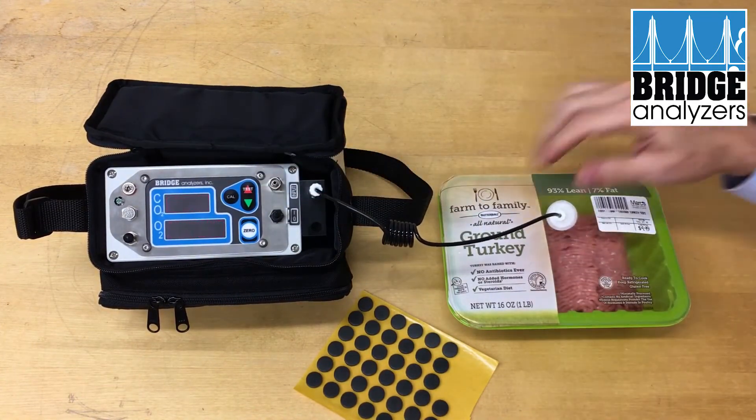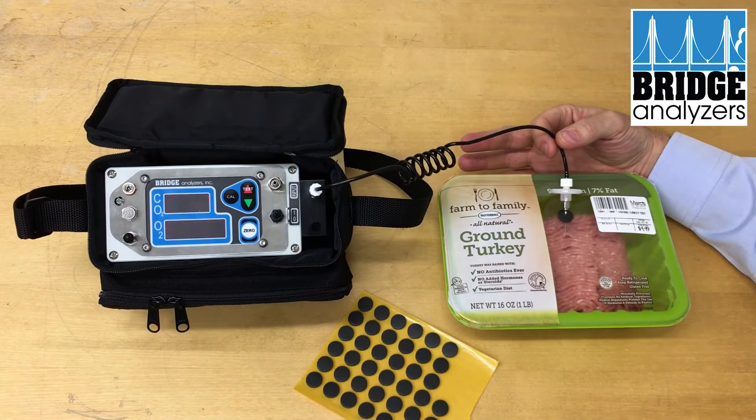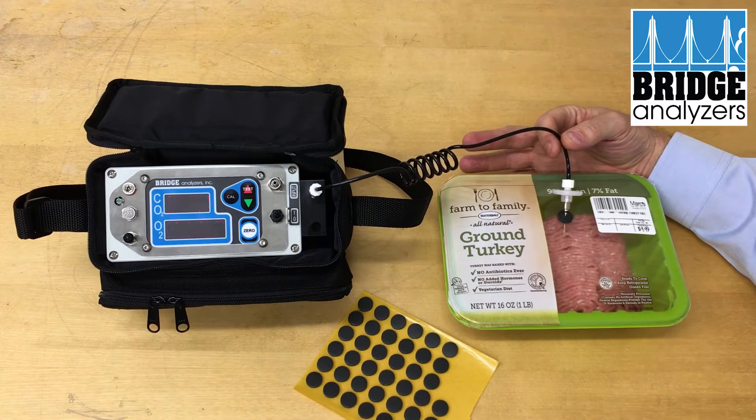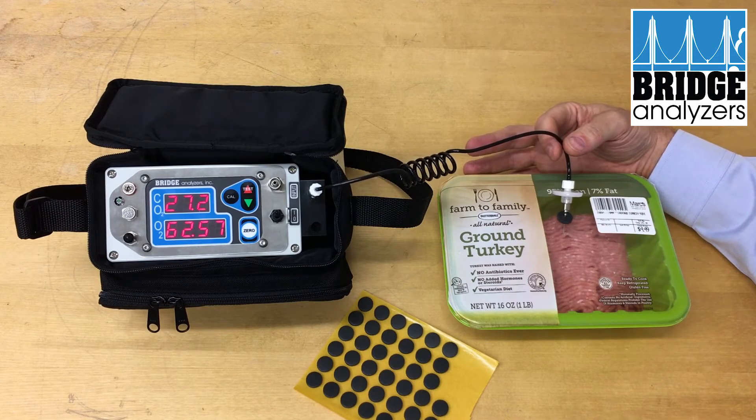At this point, the test system will be running in a blinking mode where it is doing its test, drawing in the gas. When it's finished, it will tell us what we're at — in this case, 27 percent CO2 and nearly 63 percent oxygen.